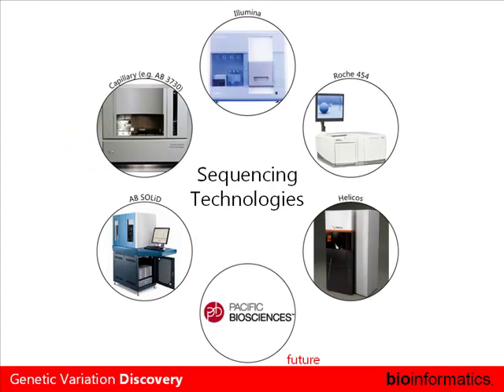The other thing that sets Mosaik apart from many other aligners is we try to support all the existing sequencing technologies. So in addition to supporting the old style Sanger capillary, we also support Illumina, 454, SOLiD, and Helicos. And when they finally release a data set to us, we'll also support PacBio.